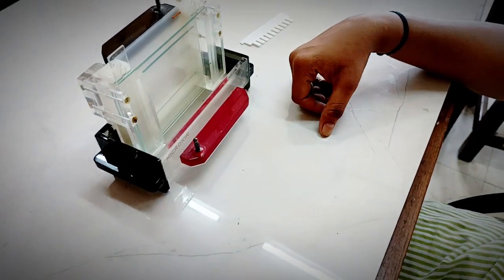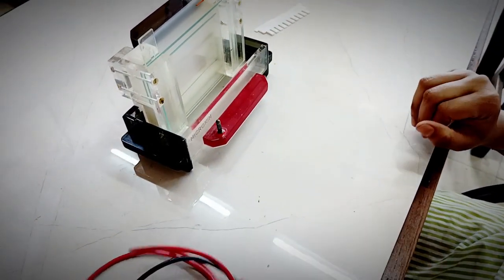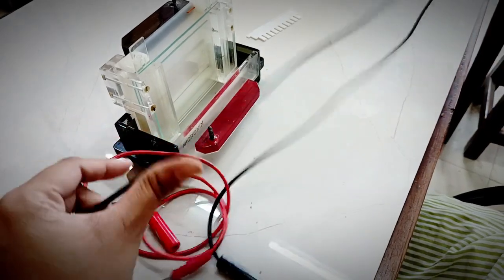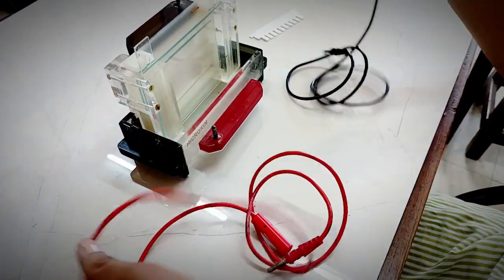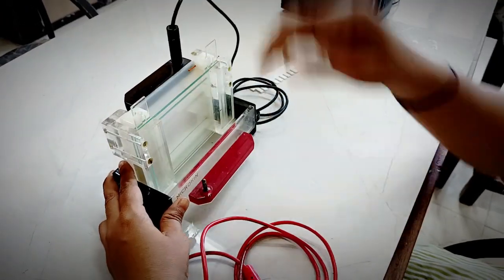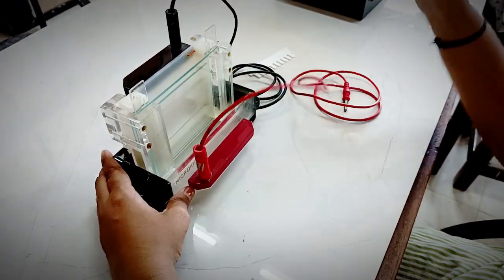And finally, once your setup is done, you are going to give the electric supply using the electrodes like black to black and red to red.